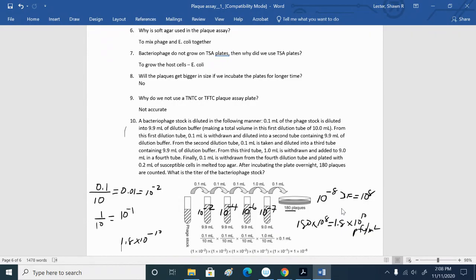And so I have another example, which some of you may remember from Biology 150. I know how much you love that class, right? You remember the amylase experiment, where you did the maltose standard curve, where you measured the absorbance of different concentrations of maltose to make a standard curve.